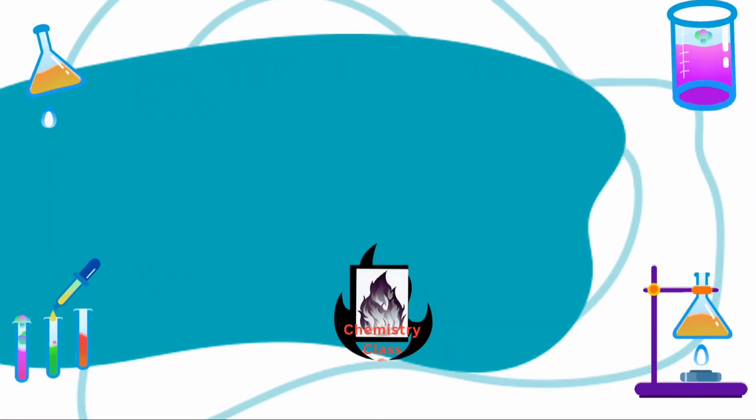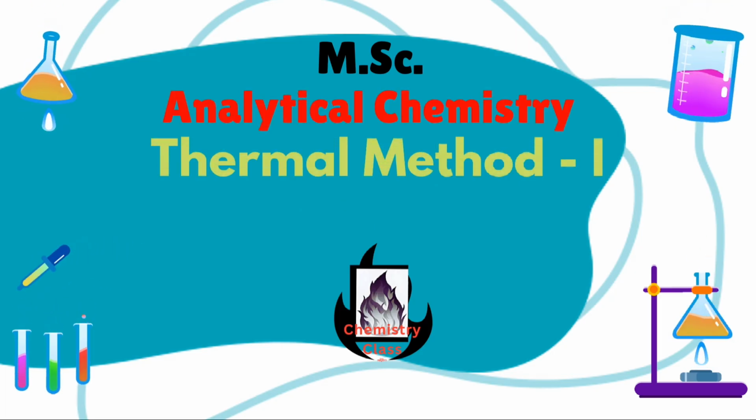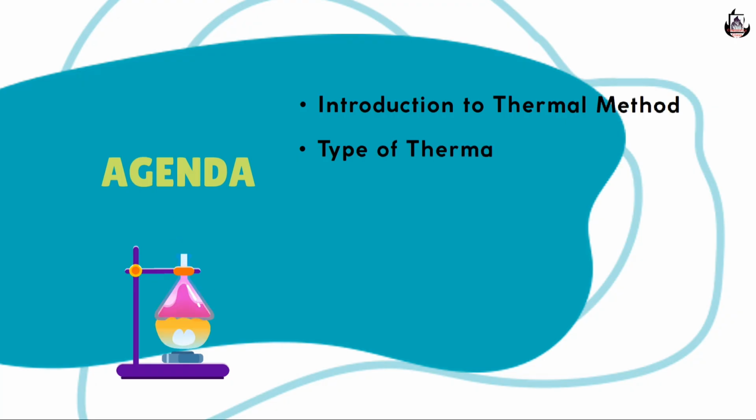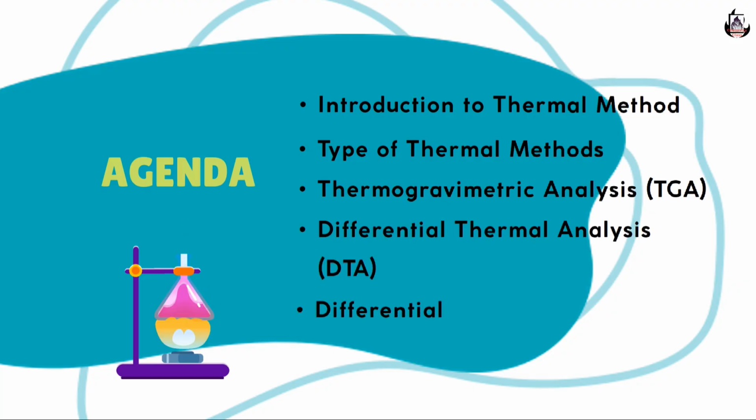In today's video, we are talking about thermal methods, a technique that helps us understand how materials behave when they are heated or cooled. In today's video, we are dealing with introduction to thermal methods and types of thermal methods. In this, we'll cover thermogravimetric analysis, differential thermal analysis, and differential scanning calorimetry. Let us start with the introduction to thermal methods.